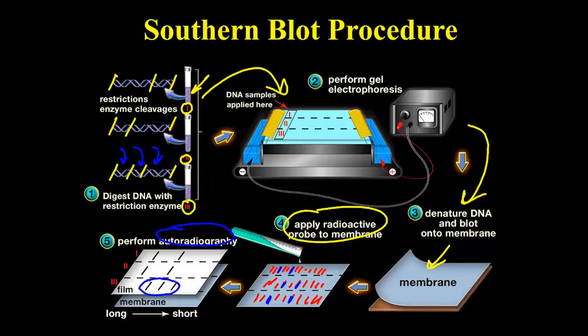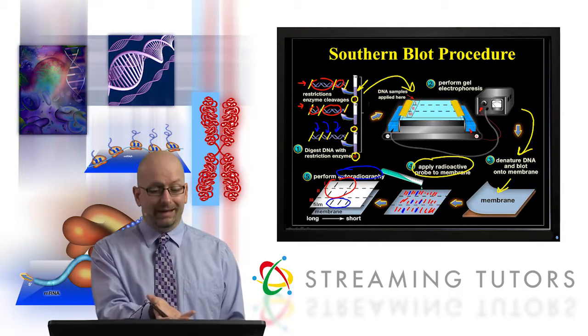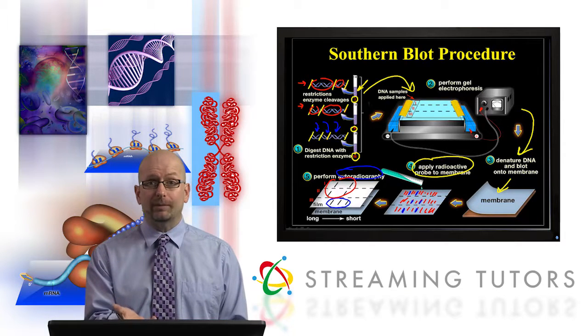Now I sort of did this on purpose, although it sort of ruins the test if it was true. These individuals in fact do have different sequences, but the way it cuts, they have 1 large piece and 1 small piece. This guy has a different large piece and small piece, but the pattern sort of looks similar there. This would ruin the test, and it usually doesn't happen because we have identified regions of DNA which are the most useful for doing this type of procedure.